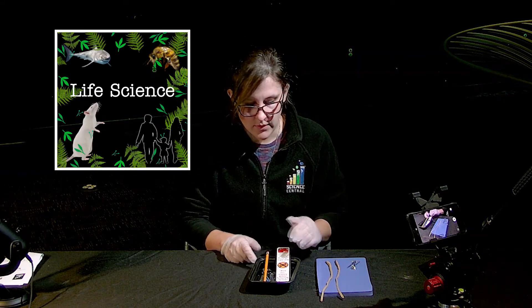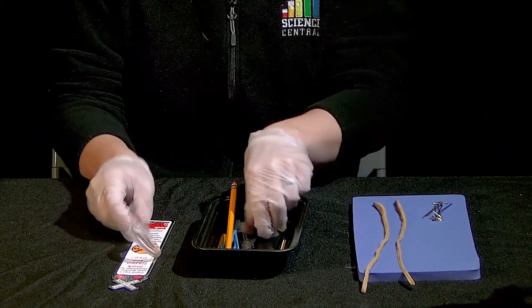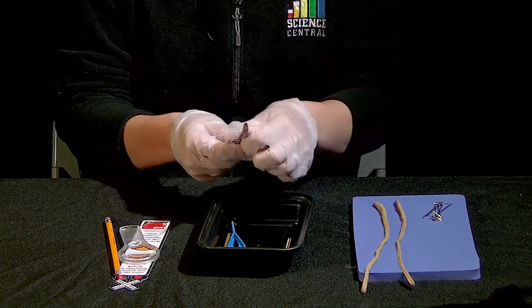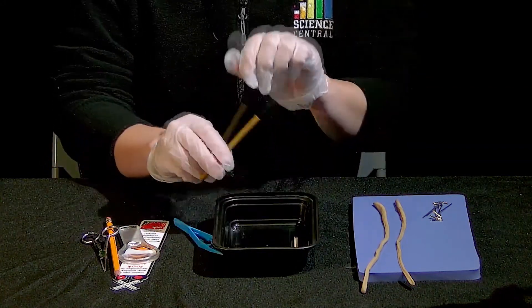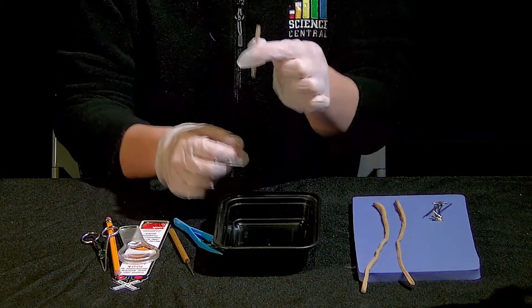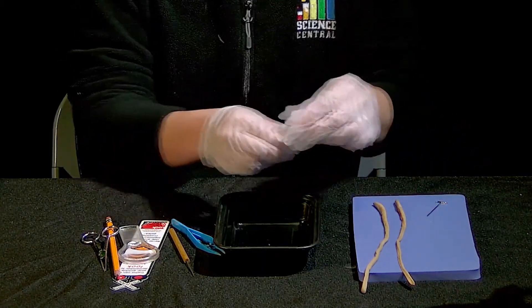We're going to start with the kits that your students should have. They should have in them a ruler, a magnifying glass, a pencil, a pair of scissors, tweezers, a probe, toothpicks, and some dissection pins.